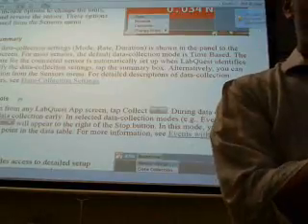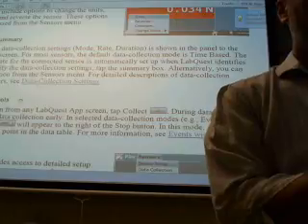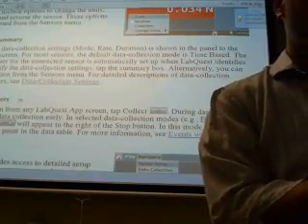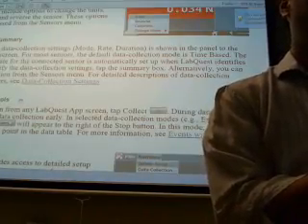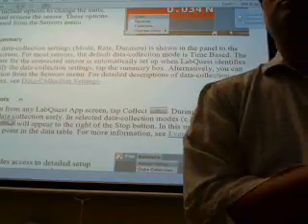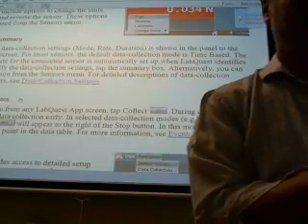One minute? Mode, time-based. What are the other options? Events with entry, selected events, photo gate timing, full spectrum, gas chromatograph, drop counting, data matrix. We're going to stick with time-based. That's what we want. Okay, the rate. How many samples per second do we want to take? We want one every 60 seconds.